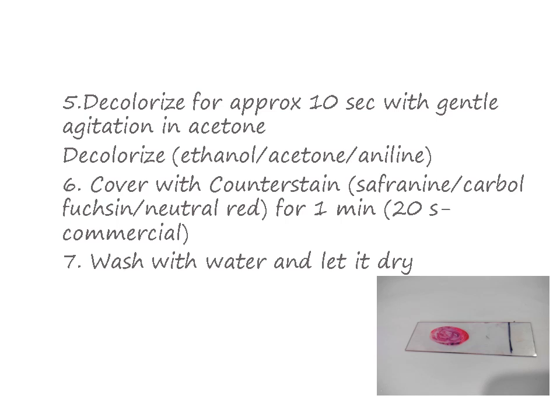After that, we need to decolorize. This decolorization is the most important step in any staining procedure. Here you will pour the decolorizer, that is acetone, onto the slide and let it wash away. After just pouring it, you will see that the primary stain gets washed away with it, and immediately you rinse it under the tap water. You don't have to put it and let it sit there for more time. Otherwise, what will happen?